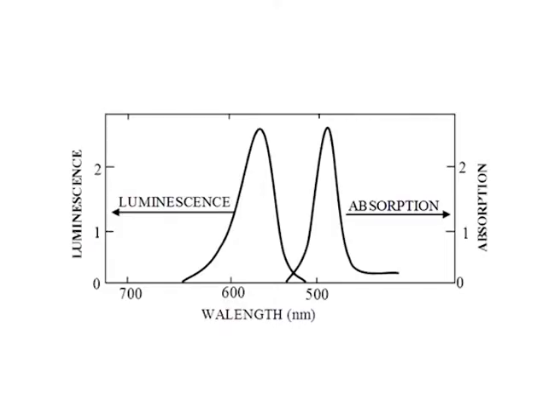The complexes formed by combination of Ruhemann's purple with europium or terbium salts too have been found suitable for fingerprint development, particularly if the background surface of the evidence is fluorescent in nature. These complexes show enhancement of the lanthanide luminescence via intramolecular energy transfer. Moreover, the lifetime of the luminescence is much longer than of the usual background fluorescence. The lanthanide complexes are therefore suitable for time-resolved luminescence imaging.